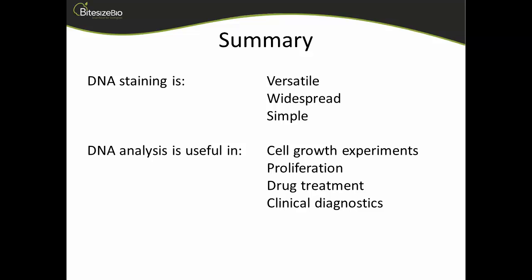But as long as we can define the populations that we're interested in, this is what flow cytometry is good at. Within that population, we can look at whatever else we've added into our mix. If DNA content is one of those, we can define our monocytes and their CD14 expression and look at the histogram of those alone rather than the whole population. Yeah, I think the high speed and multi-parametric availability on the cytometer is really what sets it apart and really gives it its power.